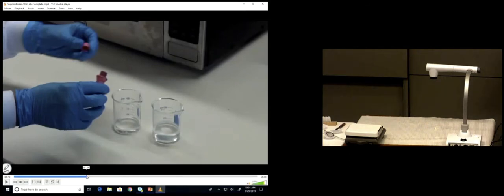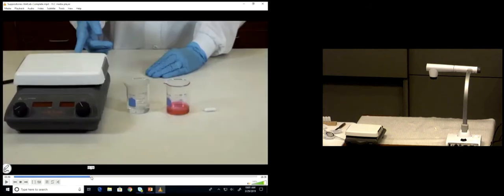Would you ever normally add a drop of food coloring to a suppository formulation? No, that's awful. People don't like color coming out of there. So no, we don't want food color in a normal product. The only reason we're doing it though, it really will help you visualize the rinsing as you're trying to get all of the drug out of that beaker and into your mold. That's the only reason we're doing that. But remember to add 1 drop of food coloring to the small vial.